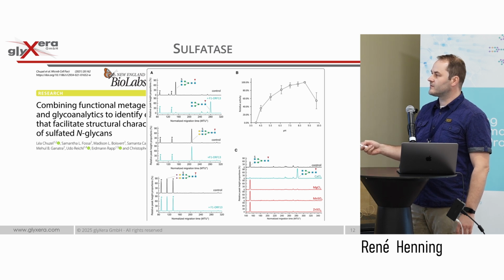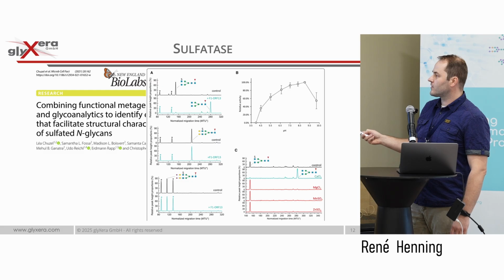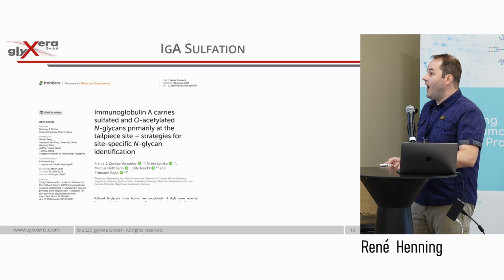And you see here, this is the initial glycan, but unfortunately if you add the sulfatase, it could not cleave this. You needed to remove sialic acids and the galactoses, and then you could also remove the sulfate. And this is only working in the presence of a co-ion, calcium chloride. Nothing else was working, so this will also be important for later on.